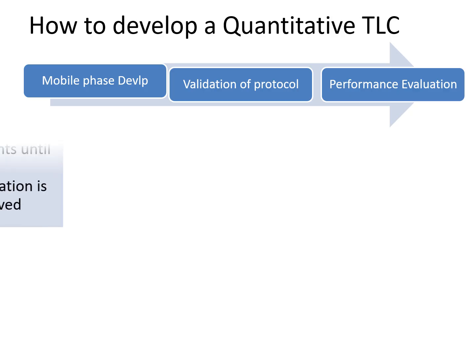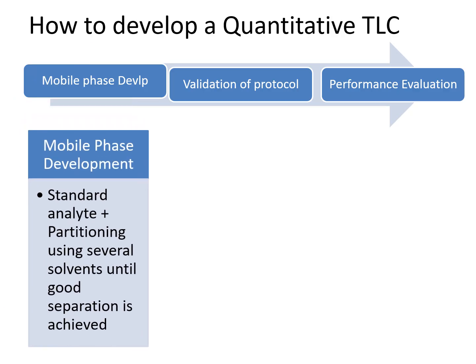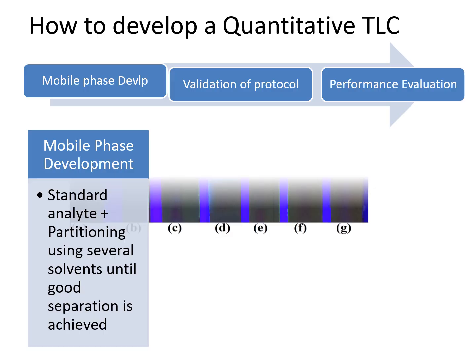Now, for mobile phase development, a standard analyte is partitioned using several solvent systems until a good separation is achieved.